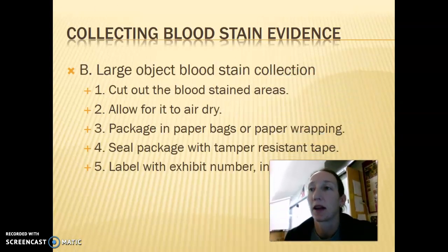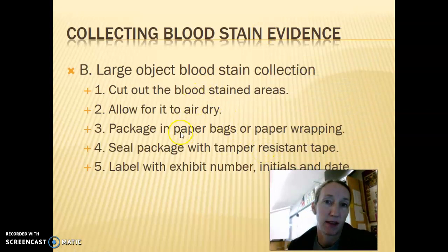If you're scraping blood off of a glass mirror or something, you can take it that way. Now, the last part is related to large bloodstains. If that is on clothing, bed sheets, carpet, if needs be, they'll cut it out. If not, they'll just package it up and take it to an evidence locker where it actually will dry out.